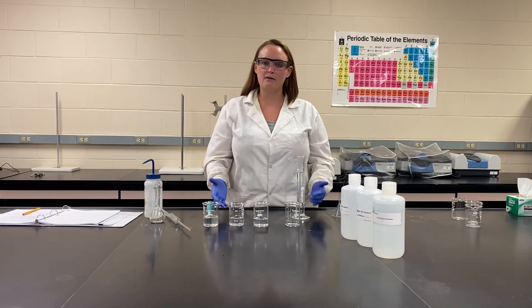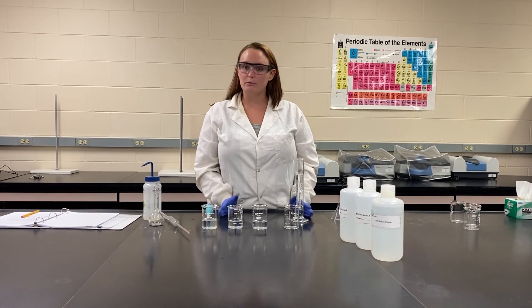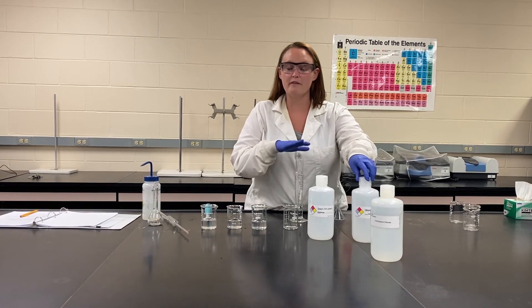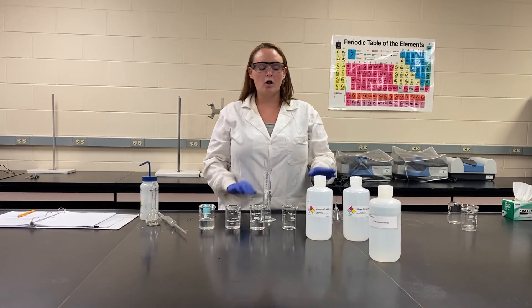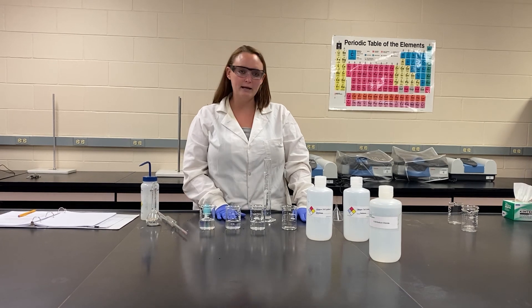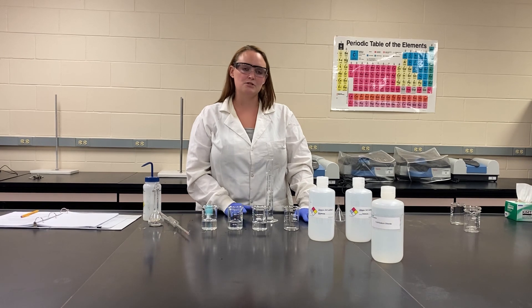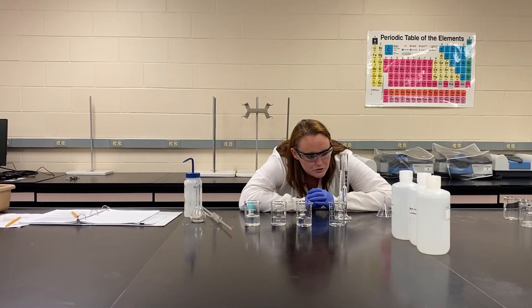Once you have your numbers for your calibration curve, you will then go to your two unknown solutions and measure them the same way in your graduated cylinder with your hydrometer. All of this data will be provided to you, and we'll walk you through how to create a calibration curve as well as plug unknown values into that calibration curve.